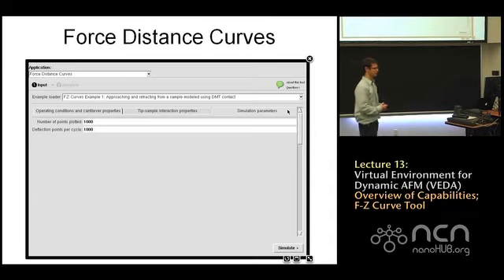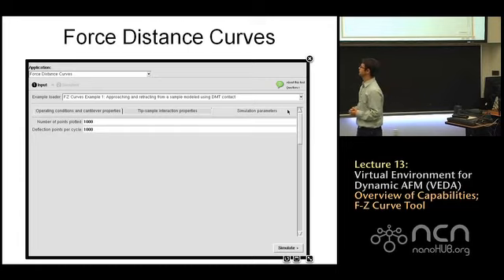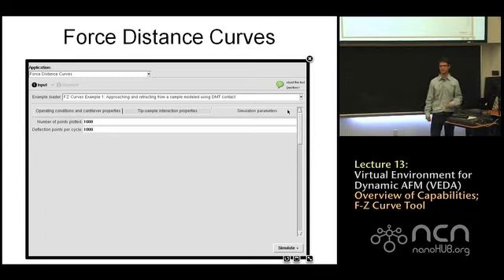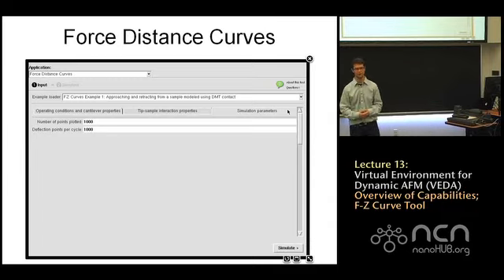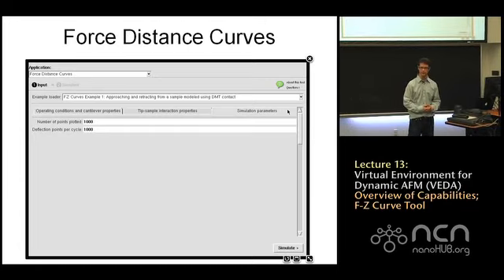It's how many points per period we integrate for our differential equation. The reason the points plotted is important is that the simulator is actually calculating hundreds of thousands of points. If we display all those, it's really going to slow down the simulation and make the file sizes huge and so forth. So that's limited here.